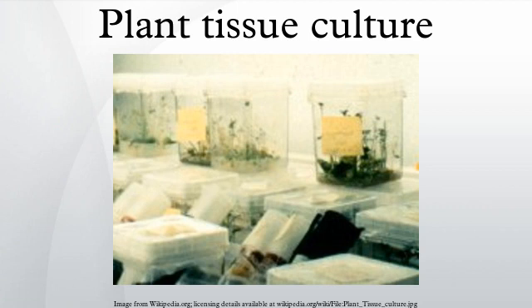Some cultured tissues are slow in their growth. For them there would be 2 options: optimizing the culture medium, or culturing highly responsive tissues or varieties. Necrosis can spoil cultured tissues. Generally, plant varieties differ in susceptibility to tissue culture necrosis. Thus, by culturing highly responsive varieties it can be managed.